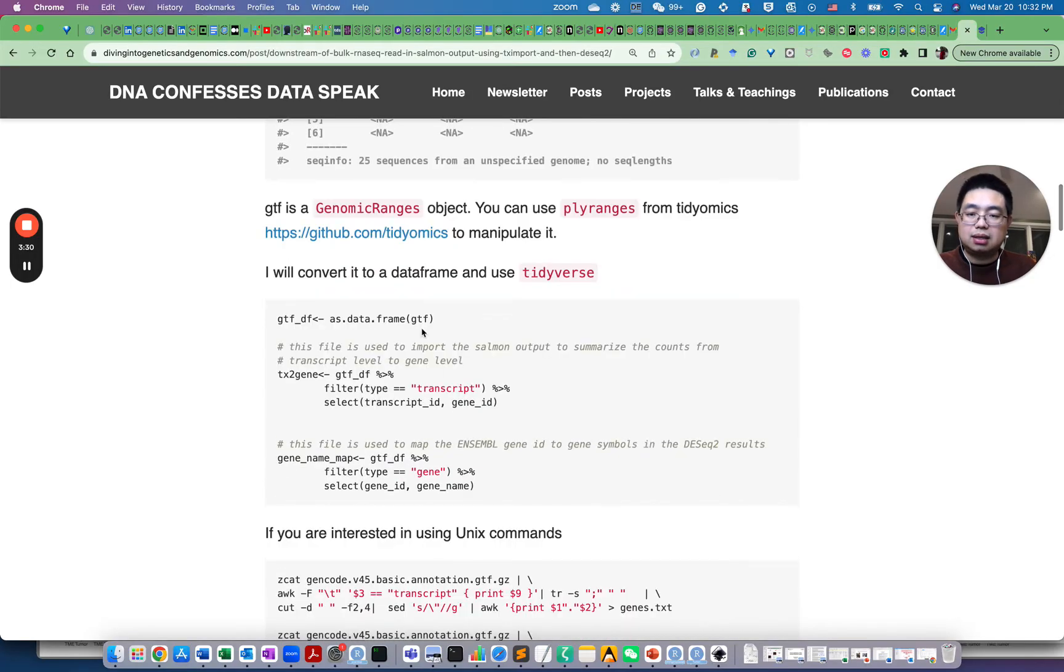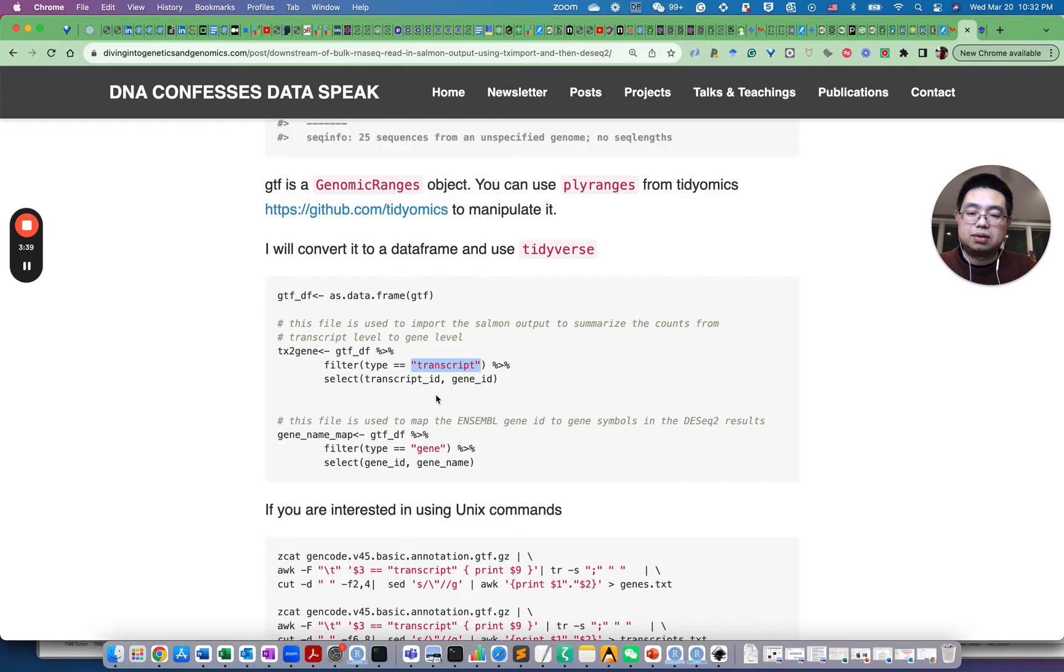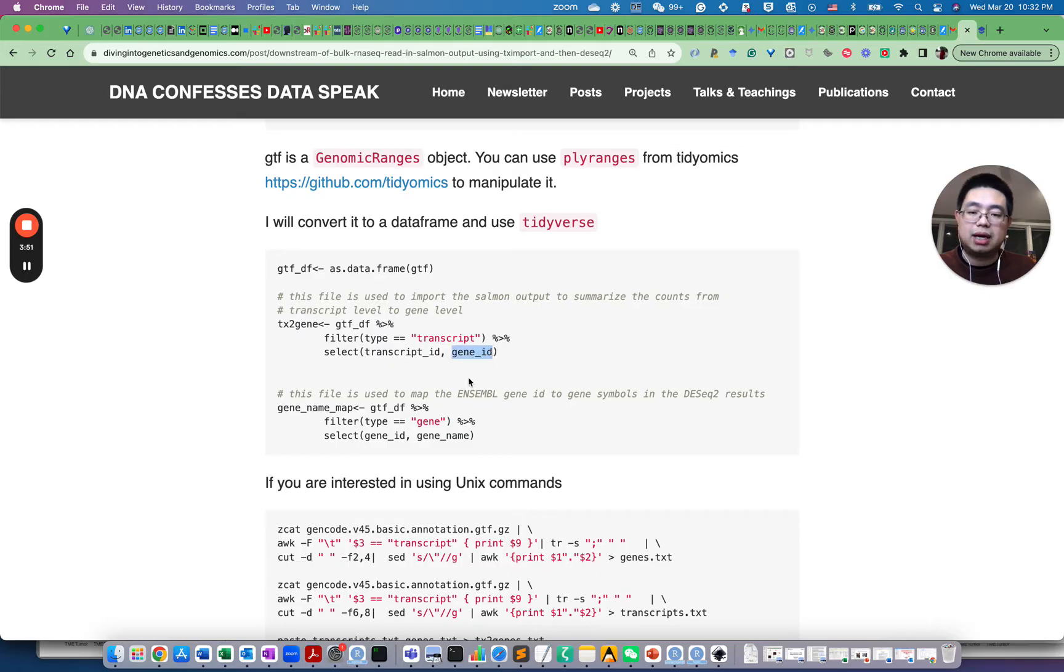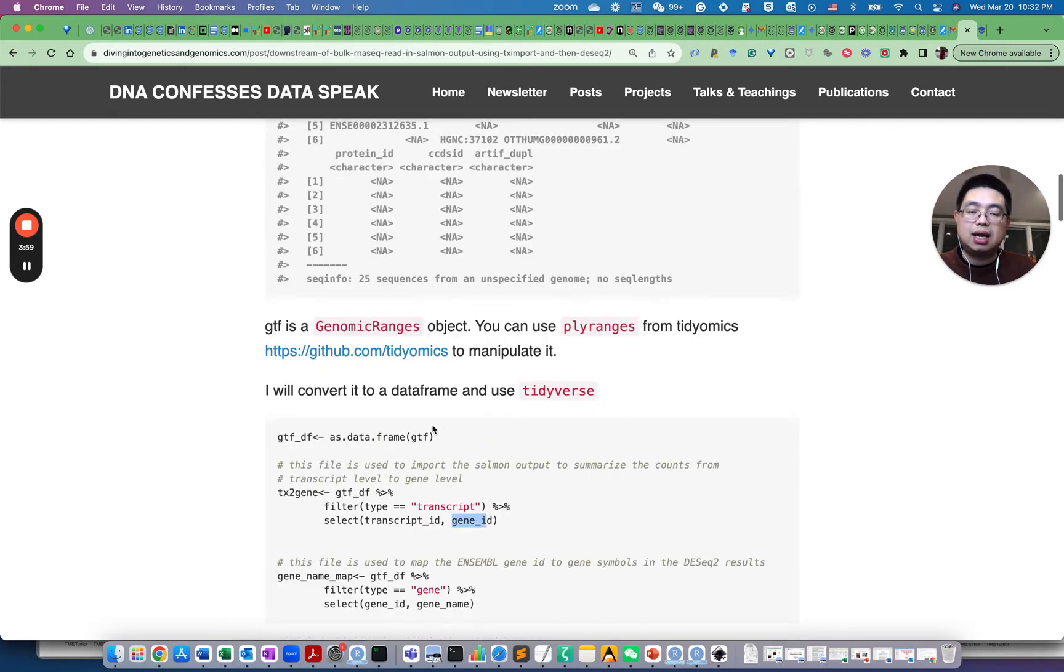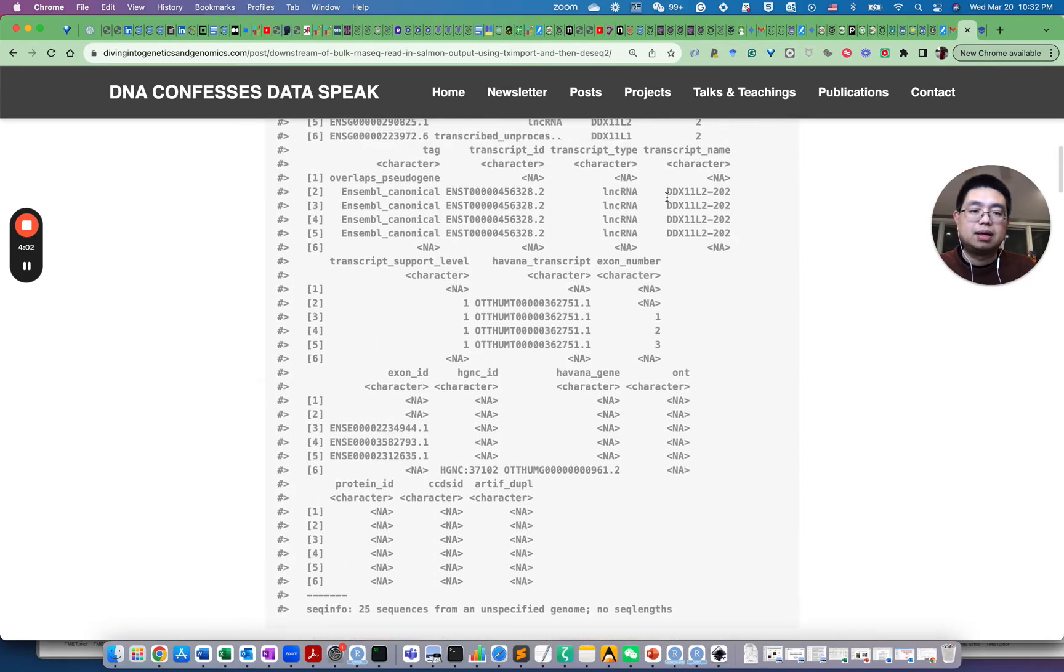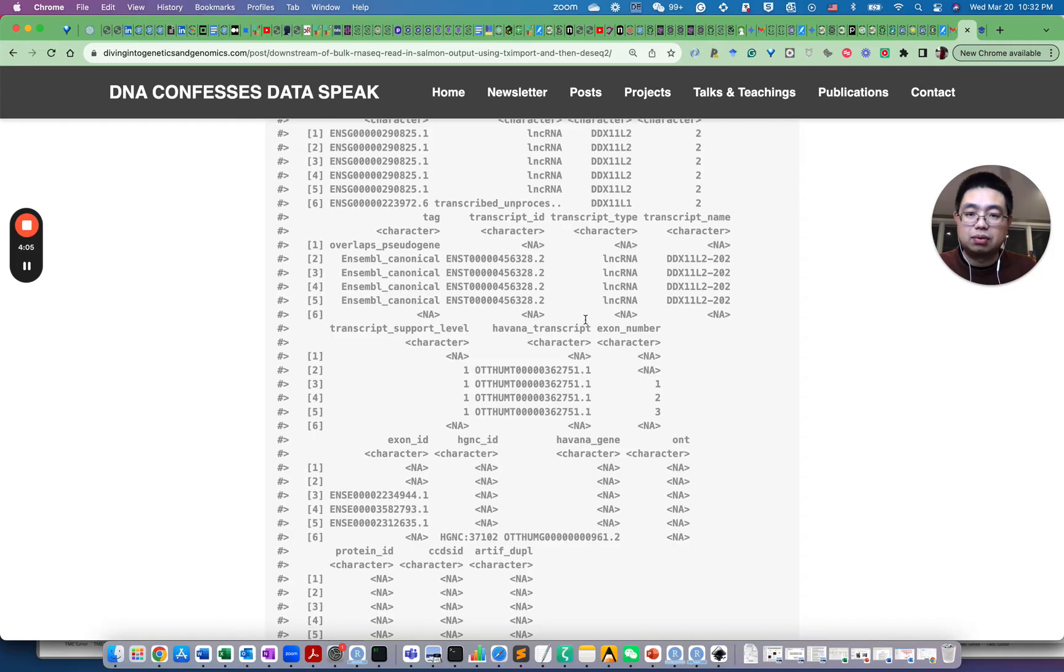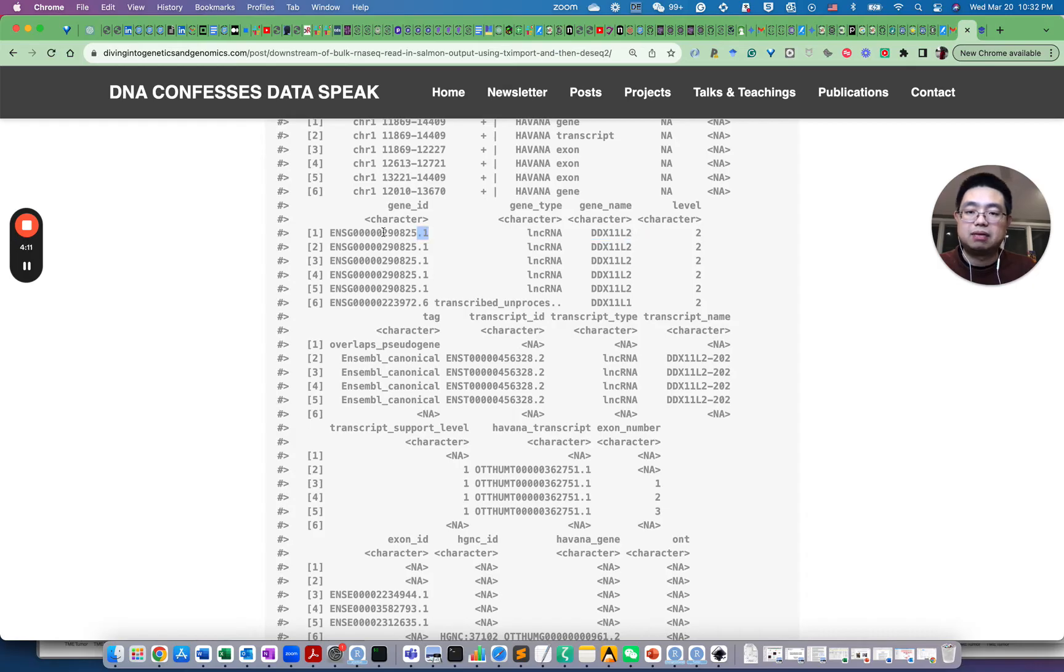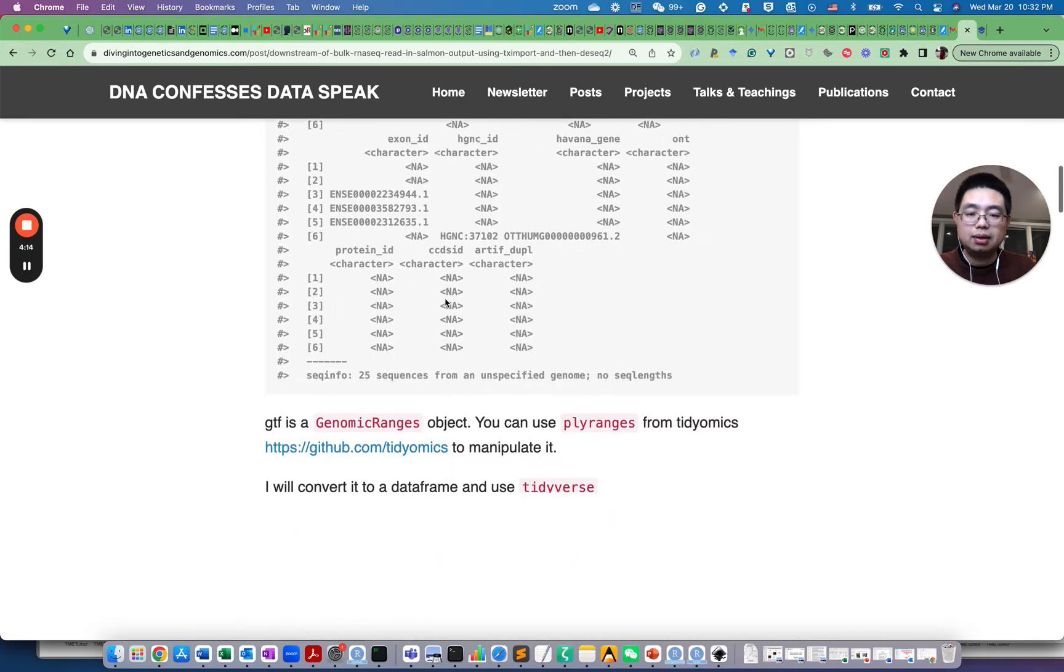Essentially, I convert that genomic ranges file to data frame and then filter by type equals to transcript and then we select those two columns so we can map the transcripts to the gene. Actually, I also prepared another file called gene name mapping file because this gene ID is the Ensembl ID. So in this case, I select the type equals to gene and then I select the gene ID, which is the Ensembl ID and gene name, which is the official gene symbol, which is more accessible to people. This is gene name here instead of those gene IDs.